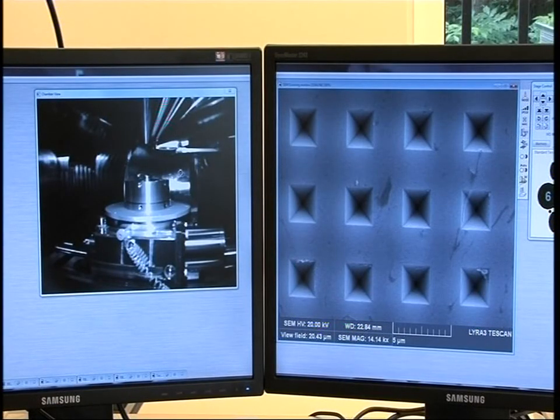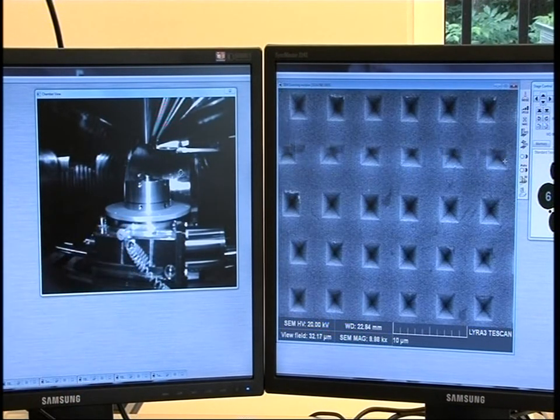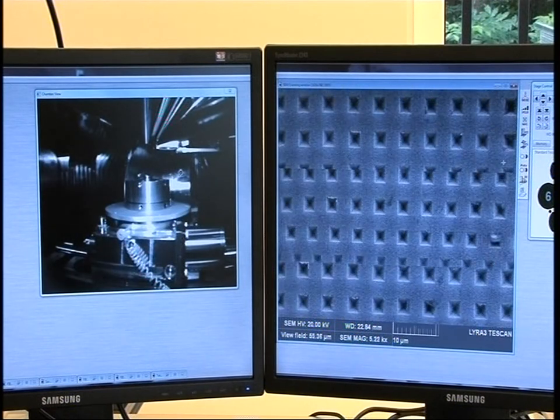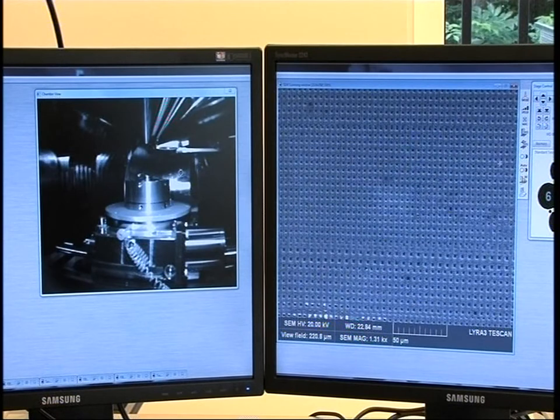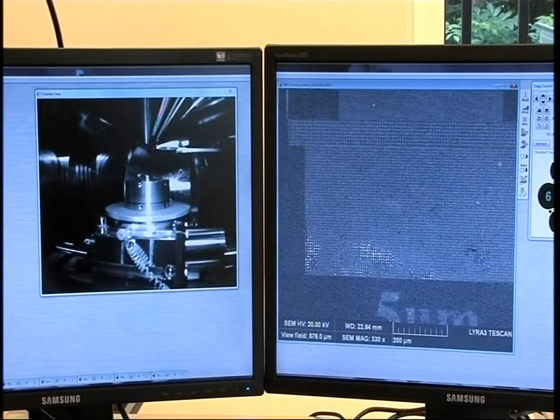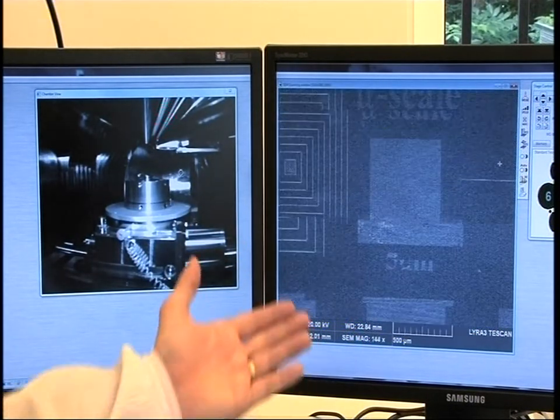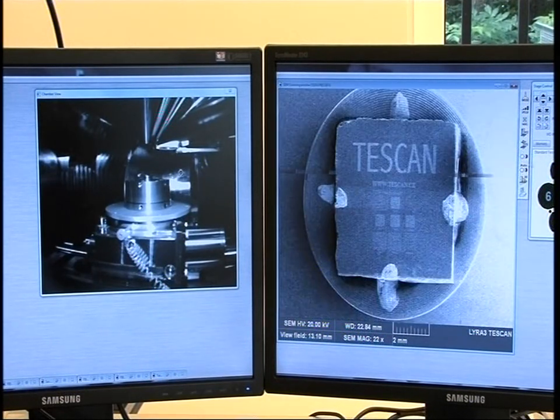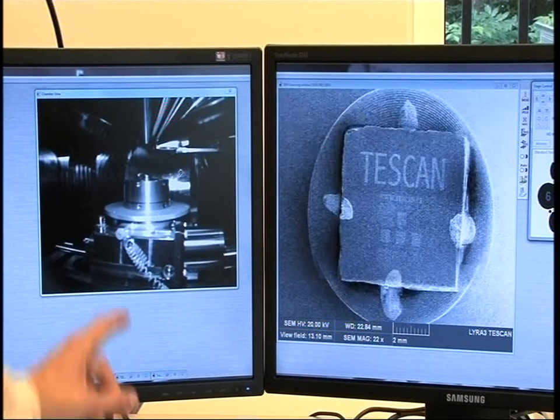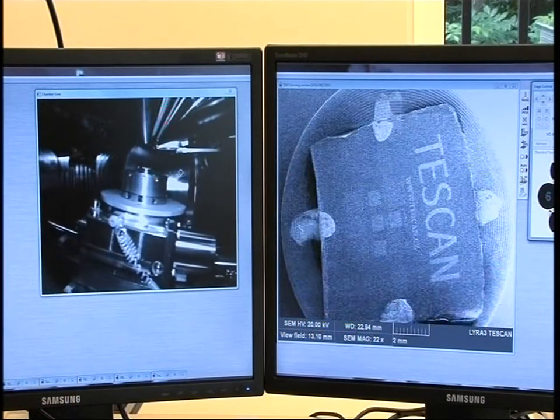The electron microscope in this unique apparatus has navigational functions too. Here we can see the image using a camera placed inside the vacuum chamber, and here we have the image from the microscope. You can see that we are gradually decreasing the image, and now we can start manipulating the image. It can be rotated, inclined, or moved.